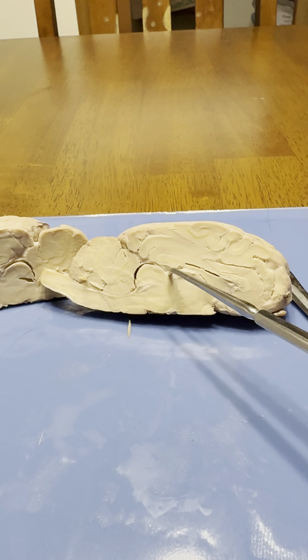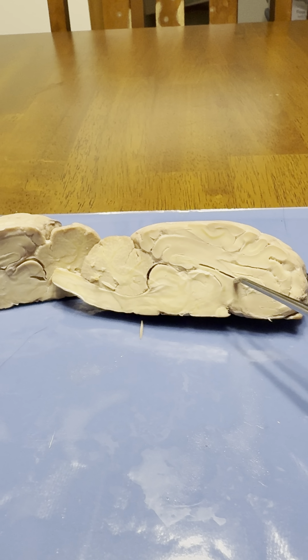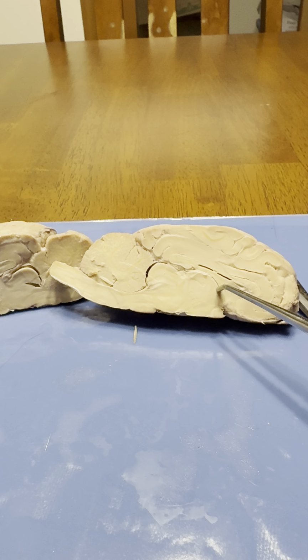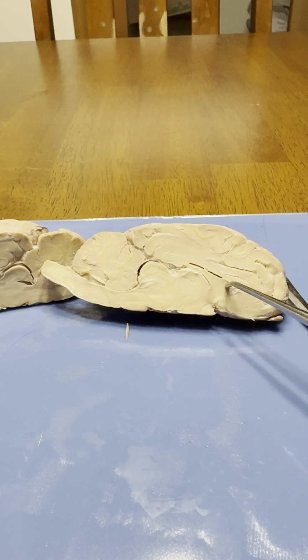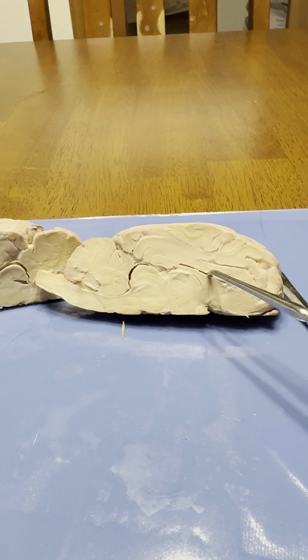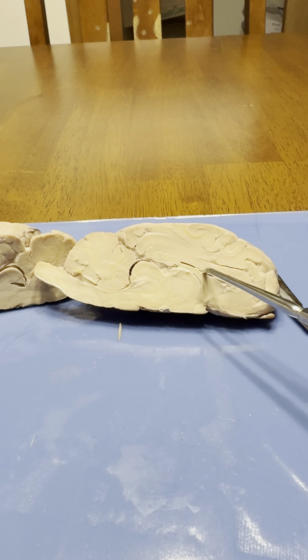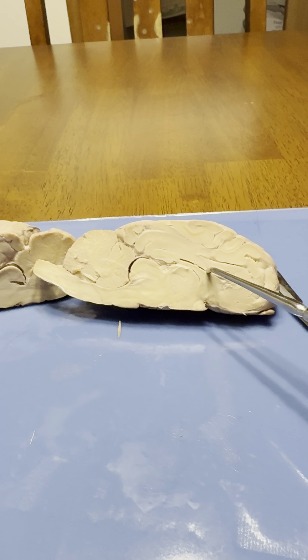And then up here, just right here, you have the septum pellucidum, which is a ventricle double membrane. And then right here, right there, is the corpus callosum, which is a large band of nerve tissue.